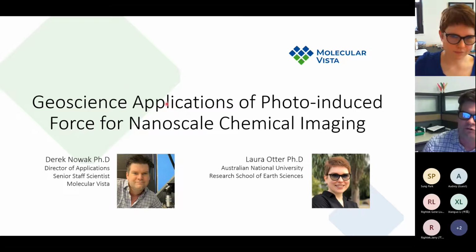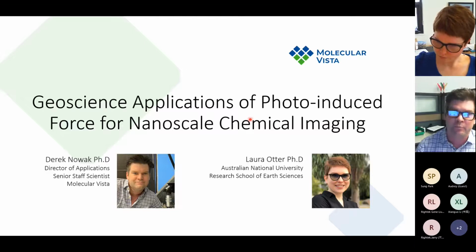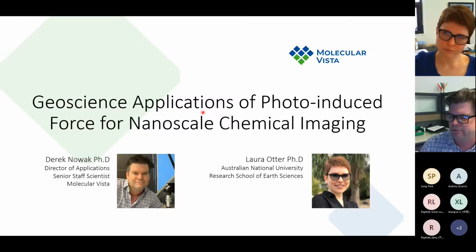I will start out with a short introduction, somewhere on the order of about 15 minutes or so, highlighting what PIFM is, what it is we're trying to accomplish with the technology, and what applications we've done, particularly in the geosciences, but also try to give an idea of what PIFM is capable of. I added in a few other little applications that highlight its extreme resolution capabilities.